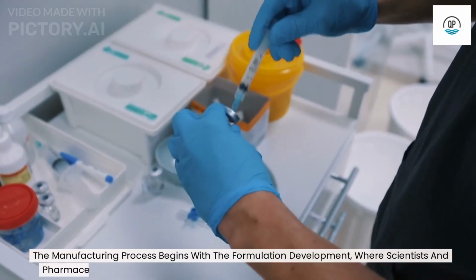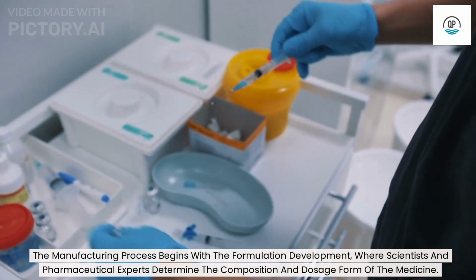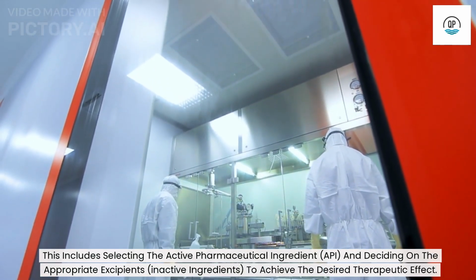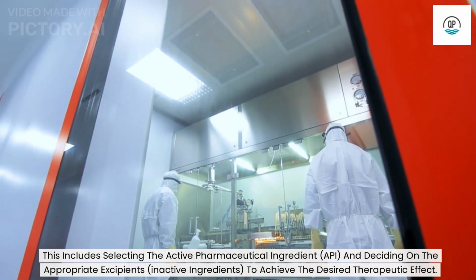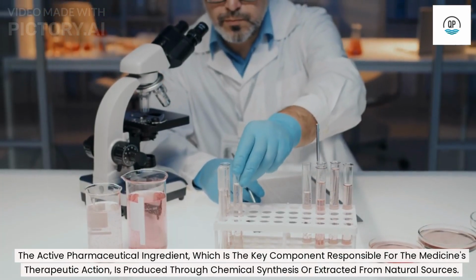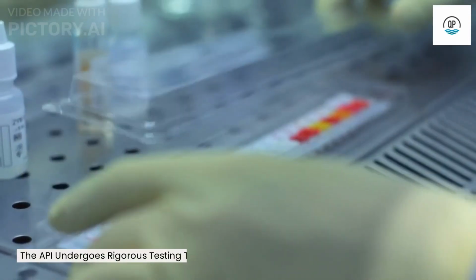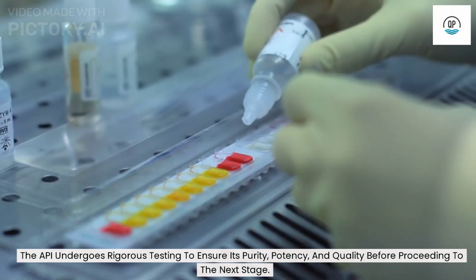The manufacturing process begins with the formulation development, where scientists and pharmaceutical experts determine the composition and dosage form of the medicine. This includes selecting the active pharmaceutical ingredient, API, and deciding on the appropriate excipients, inactive ingredients, to achieve the desired therapeutic effect. The active pharmaceutical ingredient, which is the key component responsible for the medicine's therapeutic action, is produced through chemical synthesis or extracted from natural sources. The API undergoes rigorous testing to ensure its purity, potency, and quality before proceeding to the next stage.